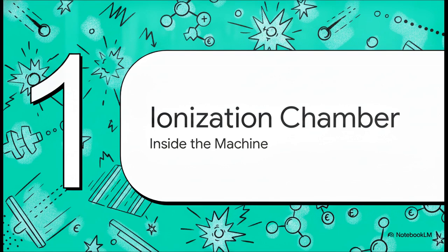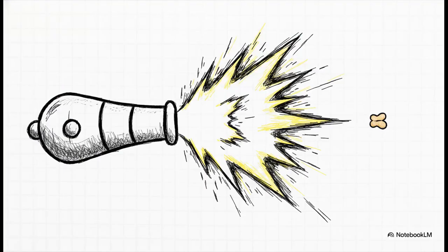Inside the ionization chamber. Okay, so picture this chamber not as some quiet, sterile laboratory, but as a high-speed, high-energy collision zone. Before a molecule can be analyzed and detected, it has to be converted into a charged particle. Inside this chamber, a filament is heated to several thousand degrees Celsius, which emits a beam of high-energy electrons. This beam acts as a catalyst, violently striking the stream of sample molecules.